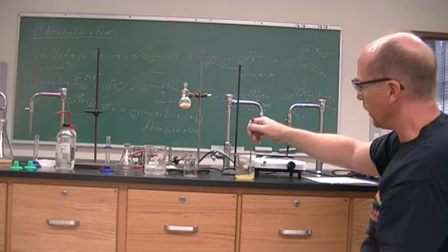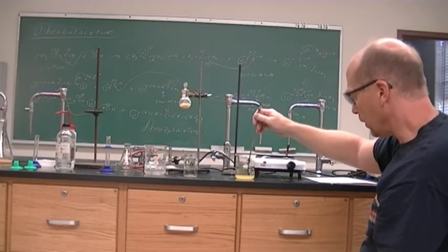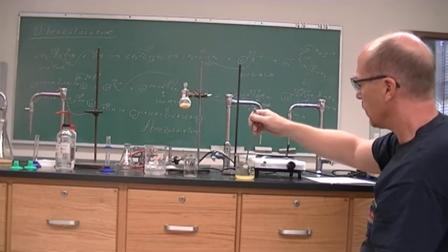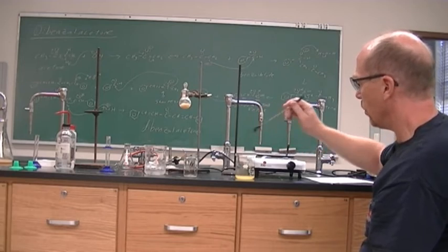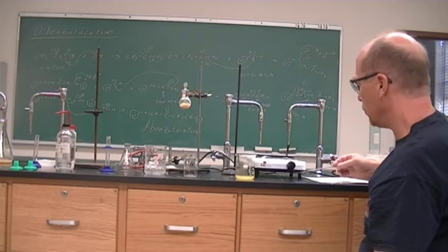That's the thing about a hot plate. You turn it off and it's still very hot. So it looks a little cloudy right now. So I think we're going to get some solid to form. And it is forming solid right now. Great.